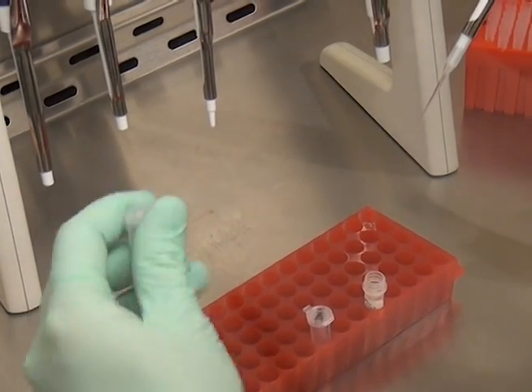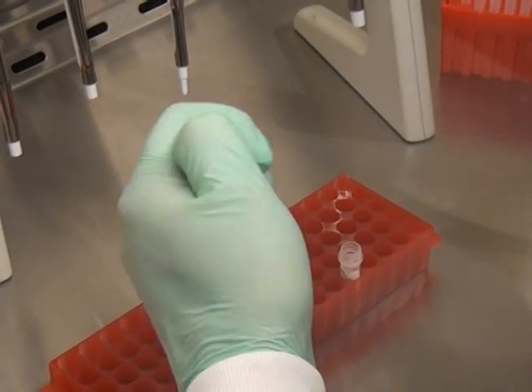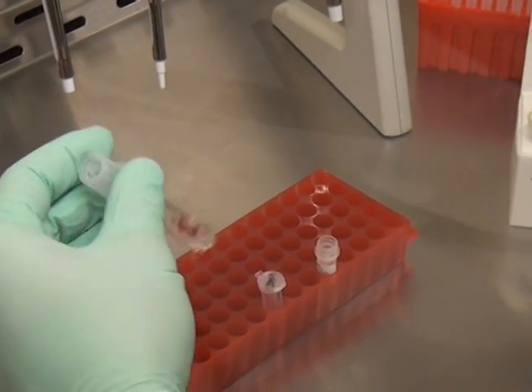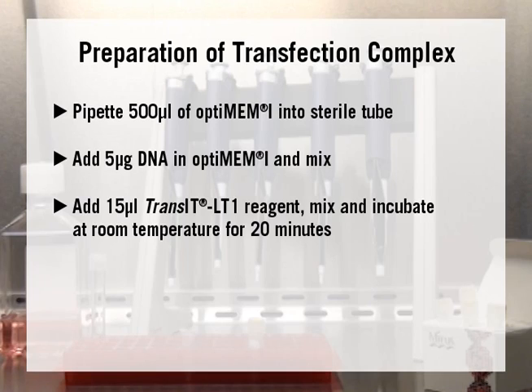Finally, add 15 microliters of Transit LT1 transfection reagent, mix, and incubate at room temperature for 20 minutes. The volumes mentioned are sufficient for 2 wells of a 6-well tissue culture plate.